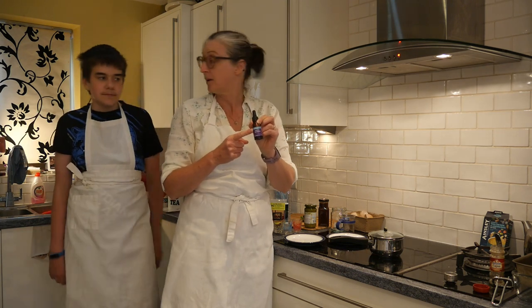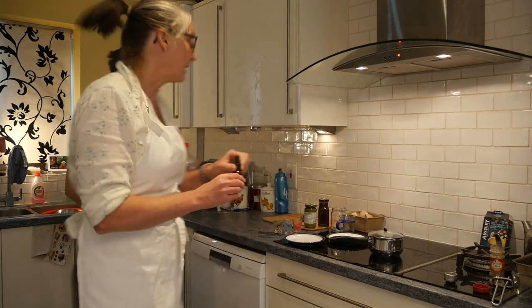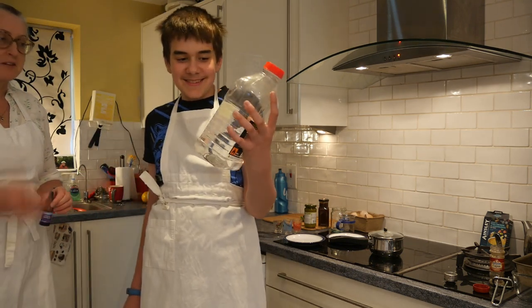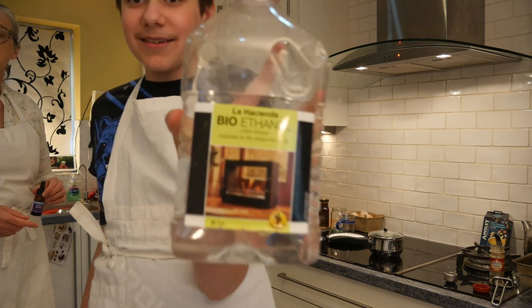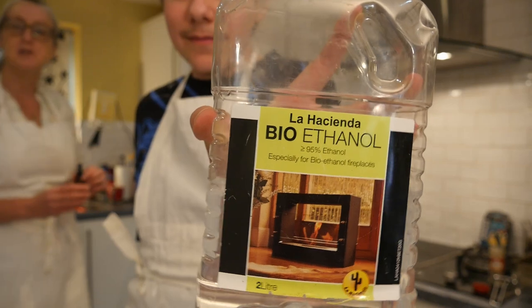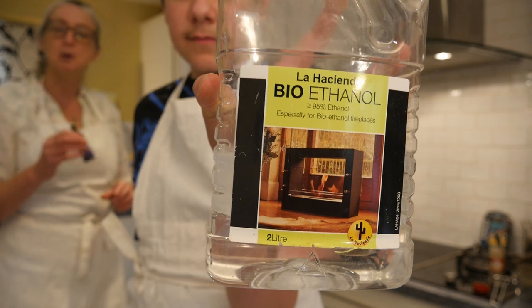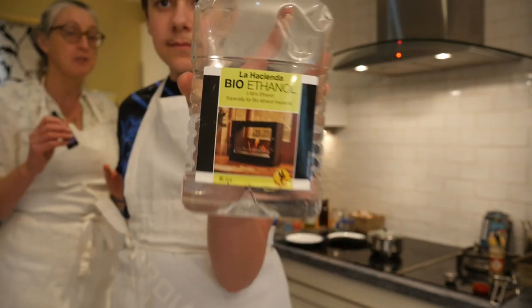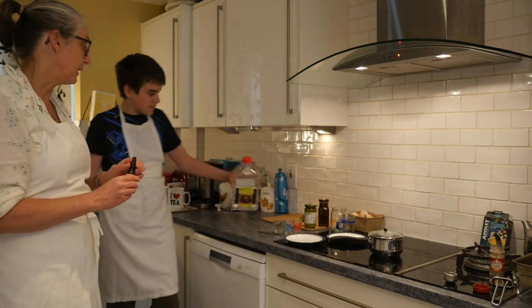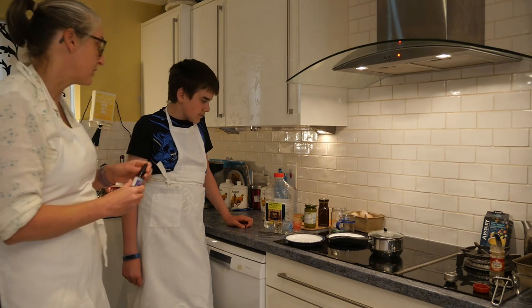You can order tincture of iodine online — it's not hard to get hold of, just look for tincture of iodine. The other chemical we've got is methylated spirits, which is ethanol. You can get methylated spirits from the DIY store — it's generally purple — and that works perfectly well for the job we're trying to do. We don't really care about the purple dye for this practical, but if you're doing other practicals where you do, bioethanol works perfectly well.